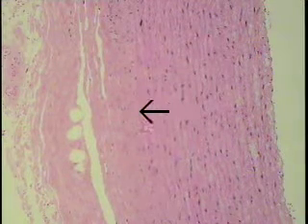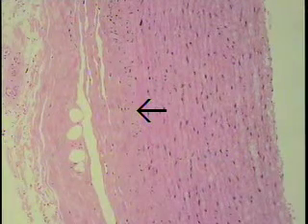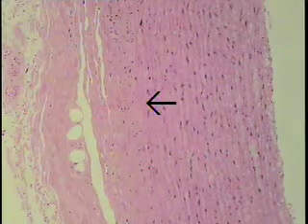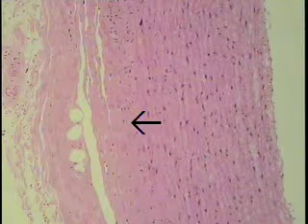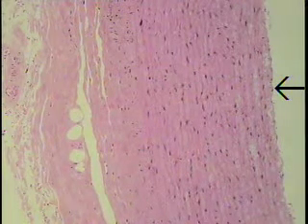This is slide number 14, the cross-section of the aorta. The intima is shown right here, at the tip of the arrow. From about this point to about here, we can focus this perhaps just a little more crisply, is the tunica media, a substantial layer in this conducting vessel, and the adventitia, this collagenous type of connective tissue and fat lying in this particular region.